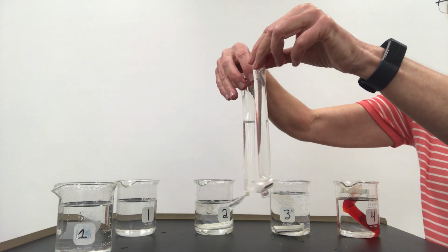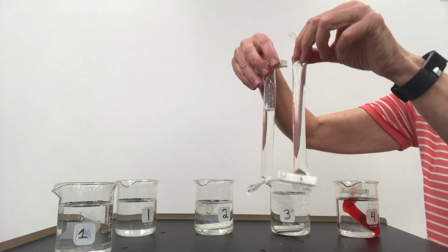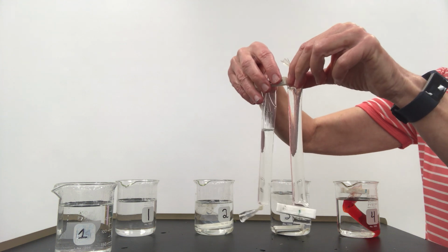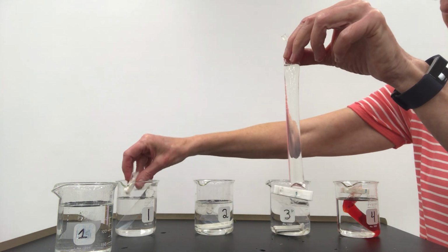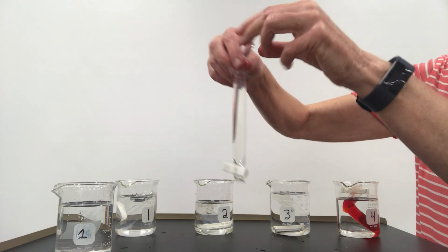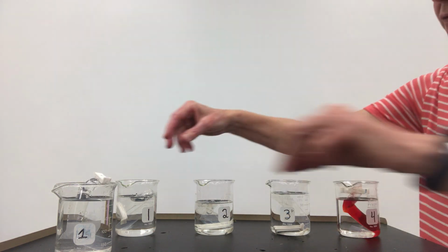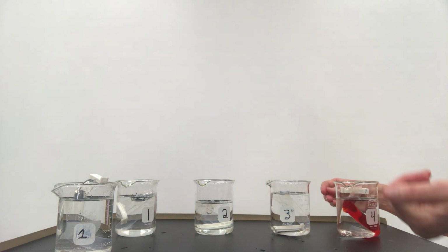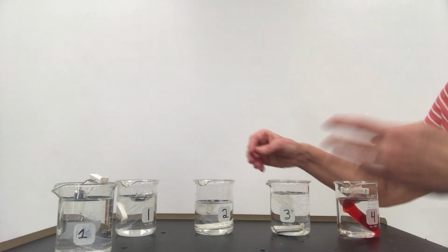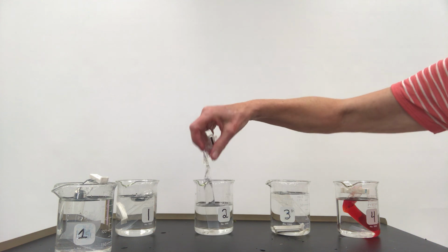So we would weigh this, we would see what the difference is between the final weight and the initial weight. That would give us how many milliliters it gained during that time period, or how many grams it gained during that time period. And then we would divide it by the time period to get the actual movement and diffusion rate of milliliters per minute, how much it gained.